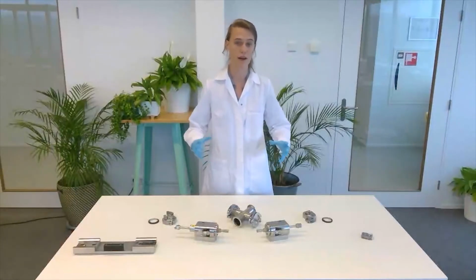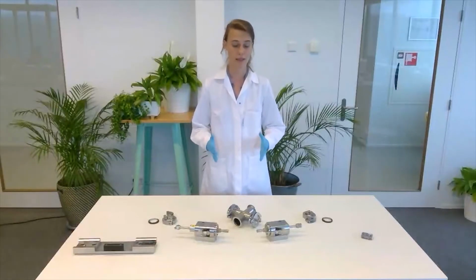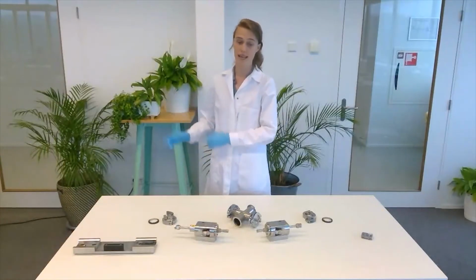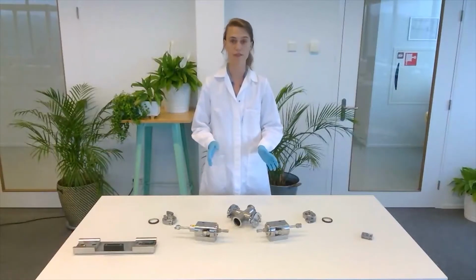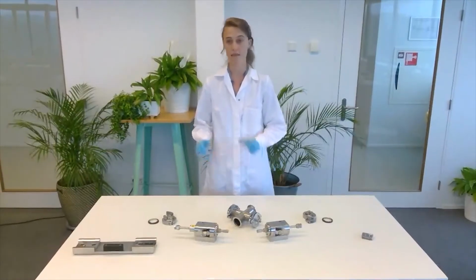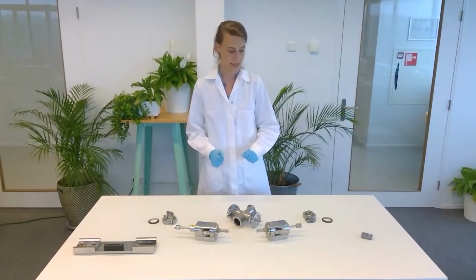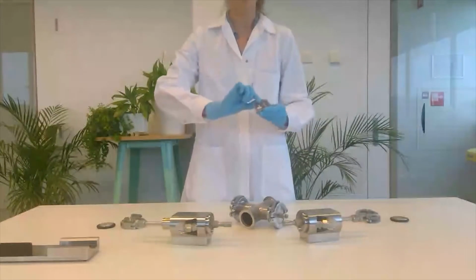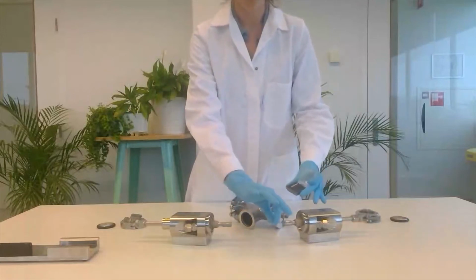First, we will need to assemble the VSP-G1 nanoparticle generator, since this is of course at the heart of our printer system. It consists of two parts. Its base unit is already at the printer, and its reactor head is laying in front of me. And I will walk you briefly through the assembly of this piece and then mount it on the printer. All we need to do for the assembly of the reactor head is choose some electrodes that we would like to spark with. Today I am taking silver. And these electrodes we click into the electrode holder.